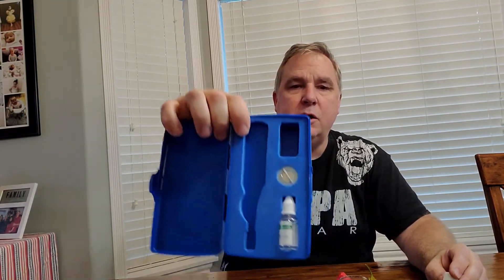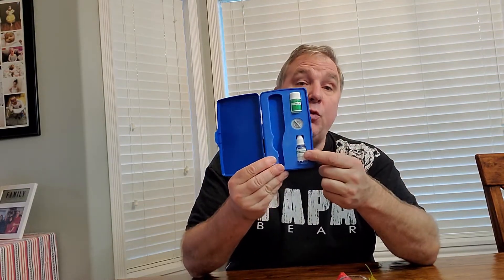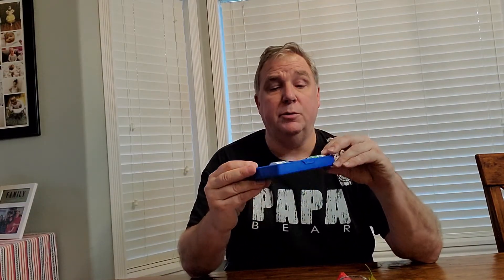Also included in the kit is the 7.0 pH solution, two batteries, and the soaking solution. If your probe dries out, Apera recommends you use the soaking solution to rehydrate it. So if you've inadvertently left it out overnight, put a couple of drops of the soaking solution on it to lubricate it again.